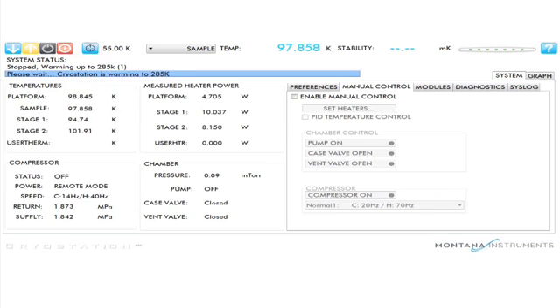To warm up, you'll simply press warm up. All heaters should engage. If nitrogen is hooked up, the system will vent at 285 kelvin, but if nitrogen is not hooked up, the system will vent at 295 kelvin.